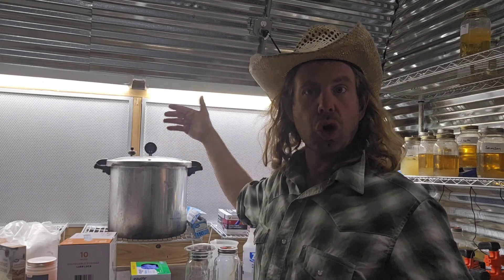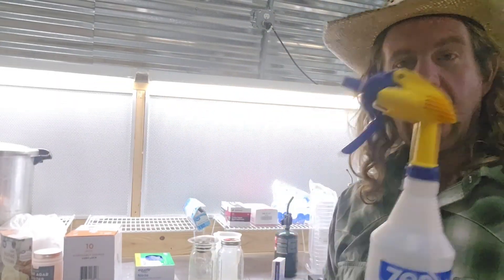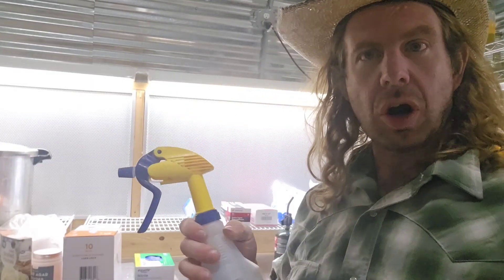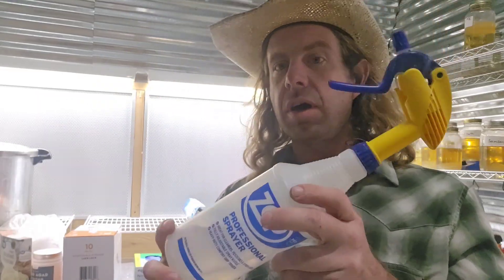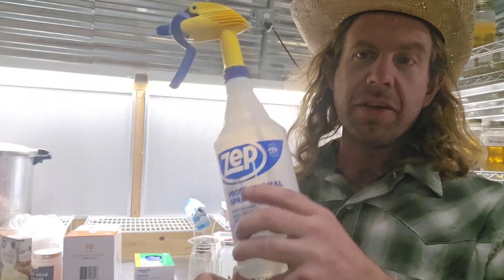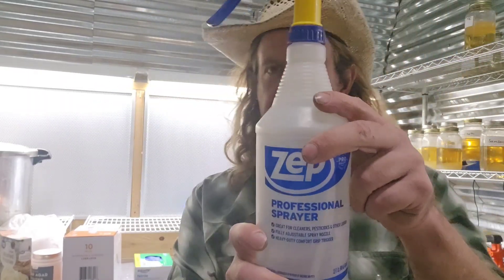Number three: a little alcohol spray bottle. This is my favorite thing to use just to wipe stuff down. Whenever I'm getting ready to do a little bit of work, I might be wiping off a jar of spawn, a jar of liquid culture, a bag of spawn — it could be anything. I like to keep a nice spray bottle full of isopropyl alcohol — I use 70% isopropyl alcohol — and this is what I use for all my sanitation needs. Number three: you're going to need some alcohol.